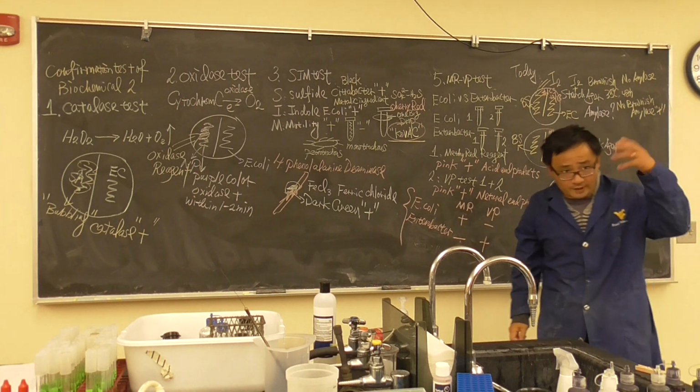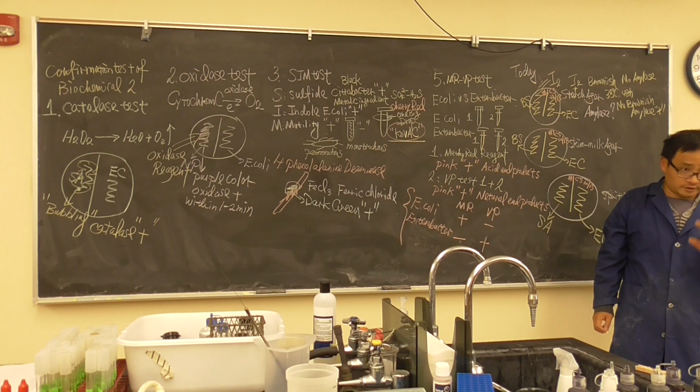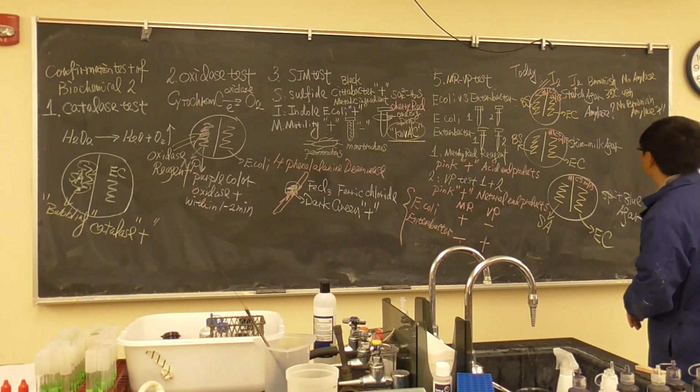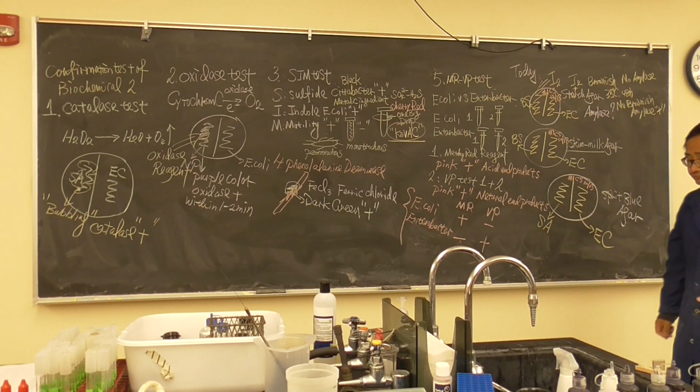Okay, so twist your mind a little bit. After incubation, we're going to dump iodine. It's the same as gram iodine. If you see a brownish color, which means starch is still there, because starch reacts with iodine, showing brownish color. If you see the brownish color is gone, there is amylase, because starch has been hydrolyzed, becoming glucose. Okay, that's very simple.